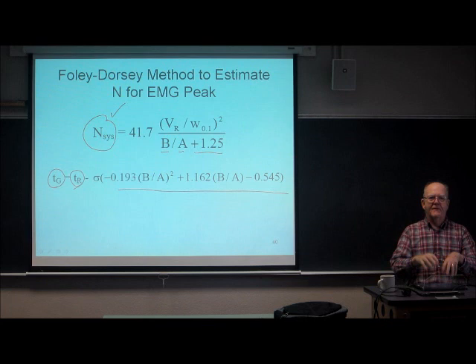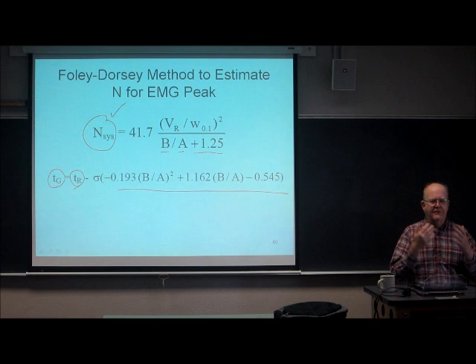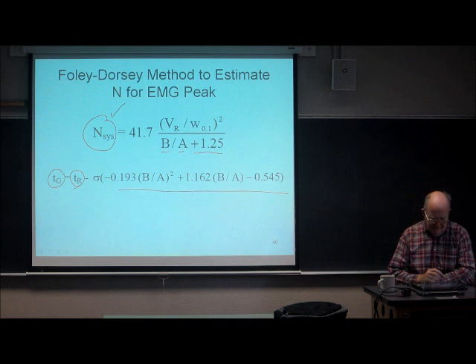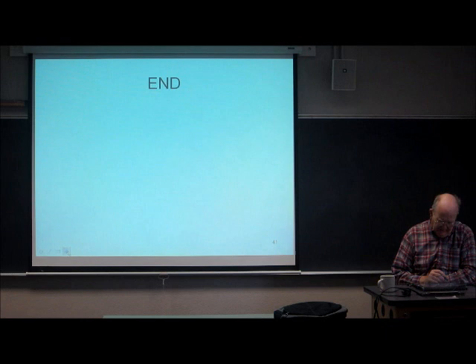Another option that you can pick on most data systems is you can say, just calculate the peak moments. That's all I care about. Just give me the first moment and the second central moment, and I'll calculate my plate counts myself. You can do that. They're not defaults. You have to go in and consciously make it happen that way. Okay, that's the end of extra column broadening.